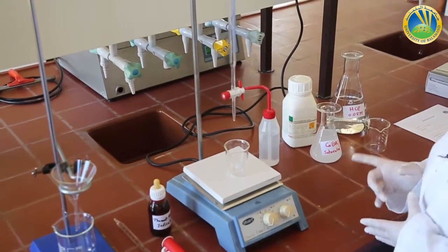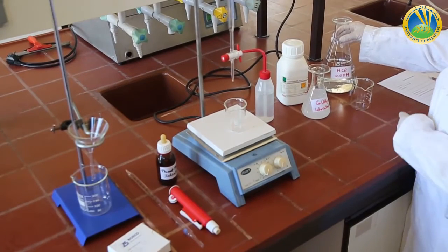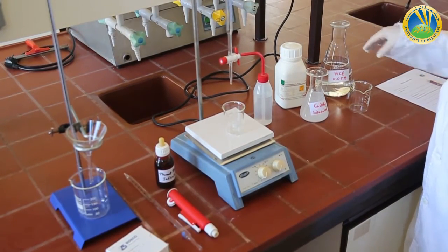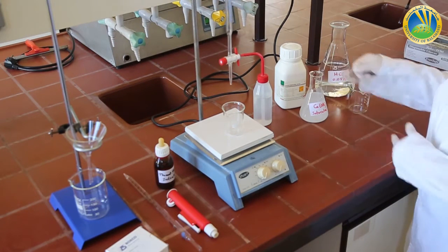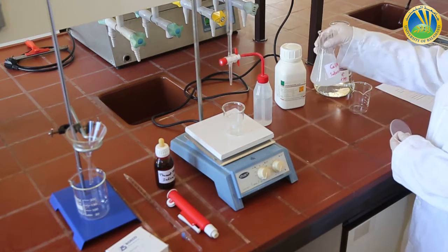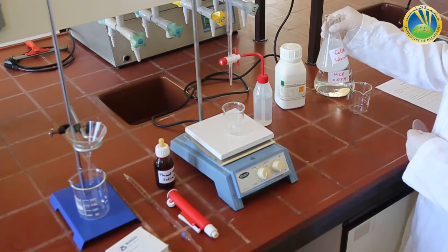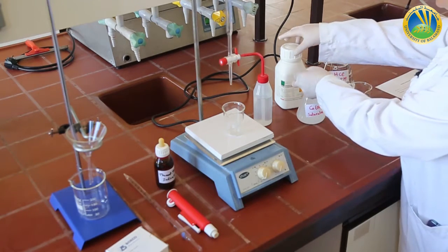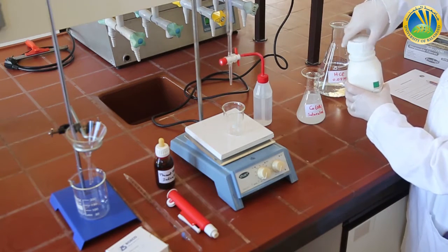The materials we are going to use are HCl 0.05 molar and a saturated solution of calcium hydroxide. I can tell it is a saturated solution because there is some precipitate at the bottom. Calcium hydroxide is a white solid, a white powder.